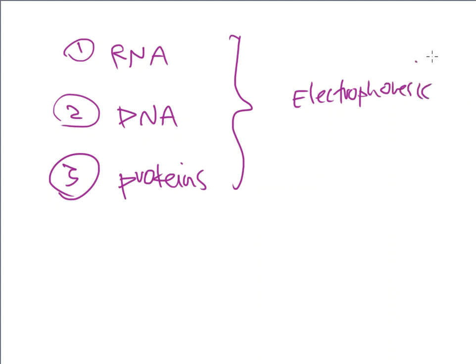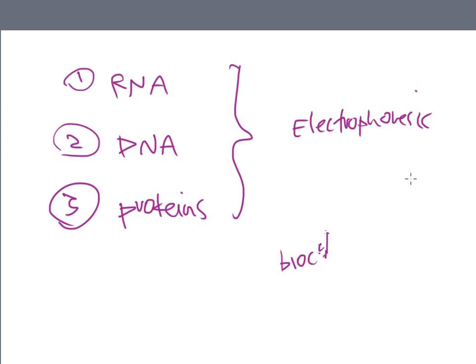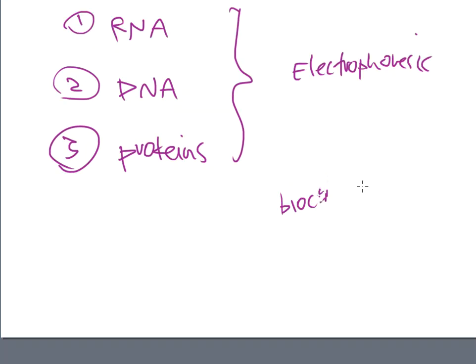What we're doing in this lab experiment, we're not looking at proteins. That's going to be a modified version of electrophoresis. But what we're doing here is taking the idea of RNA and DNA, and we're going to be injecting a sample onto an electrophoresis gel and putting it into an electrophoresis chamber in order to separate the components inside this sample. All of these have a very strong tie to electrophoresis. This is really dabbling into the world of biochemistry. That's the proper term.